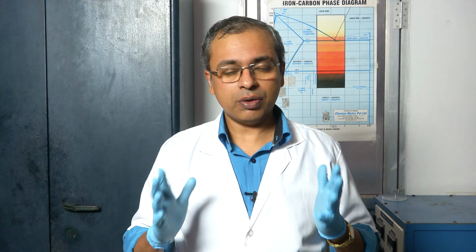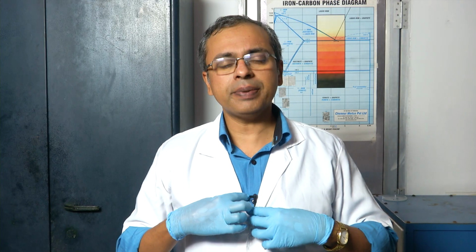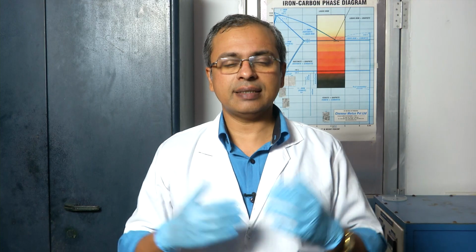So, common things that are good to have and good to wear on a regular basis, which automatically build safety into many of the things that you do, are, first of all, to wear a lab coat. So, the moment you come to a lab, you should have a lab coat and you should put it on. It is a simple thing that you put on which immediately adds some safety to you. So, if a few drops spill on you, they do not directly fall on you, they fall on your lab coat.